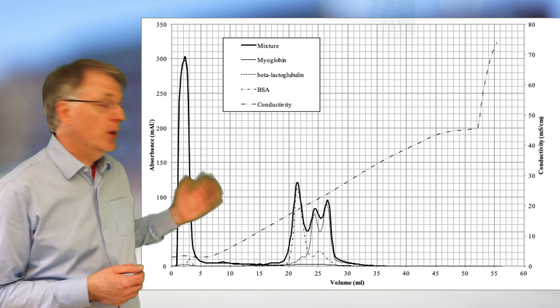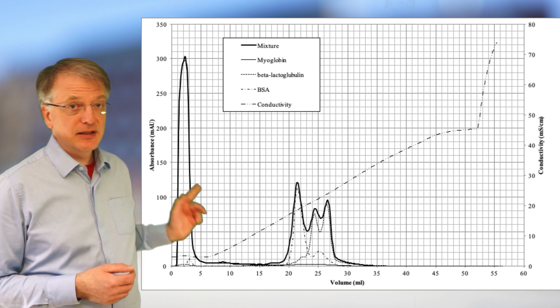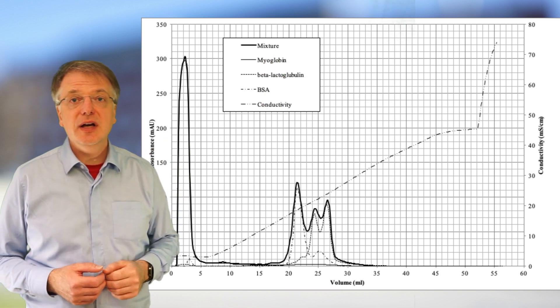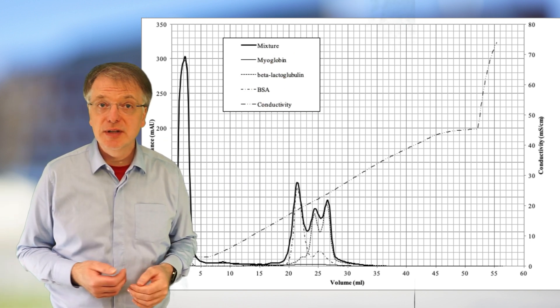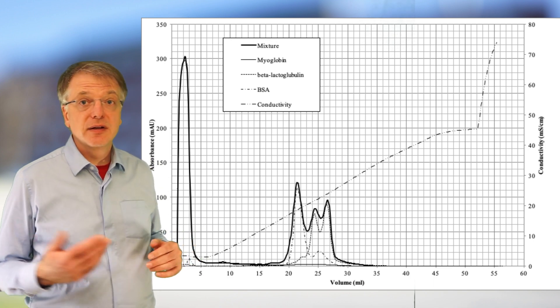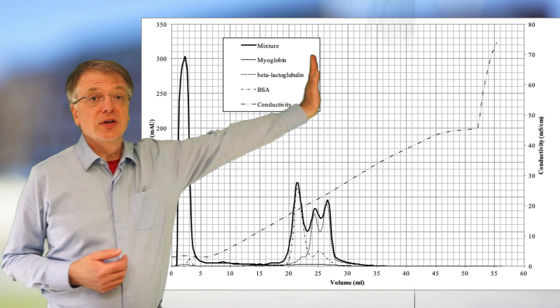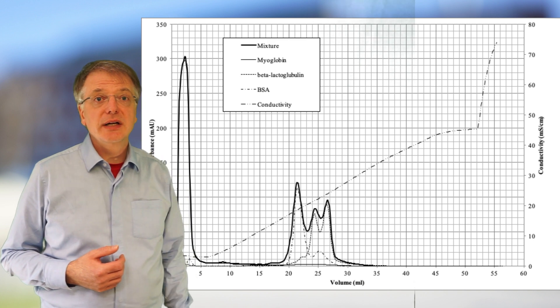First a few words on what we see in this chromatogram. The dashed line that increases with time is the measurement of the conductivity and you can see the values of conductivity on the y-axis to the right.